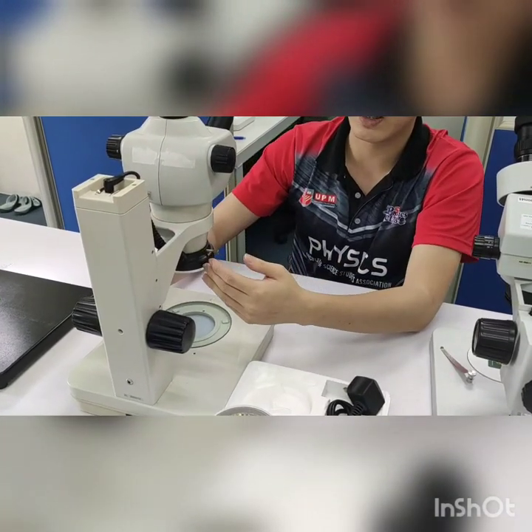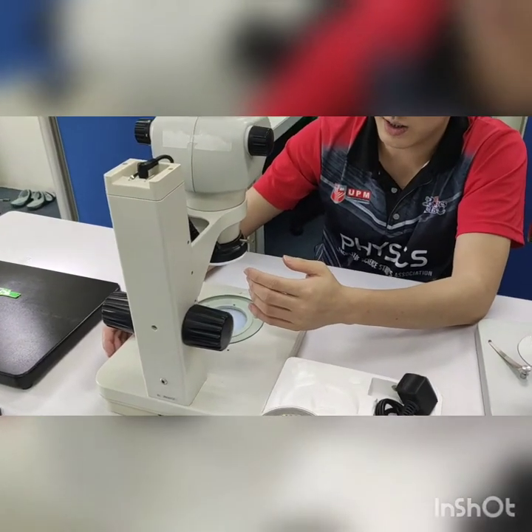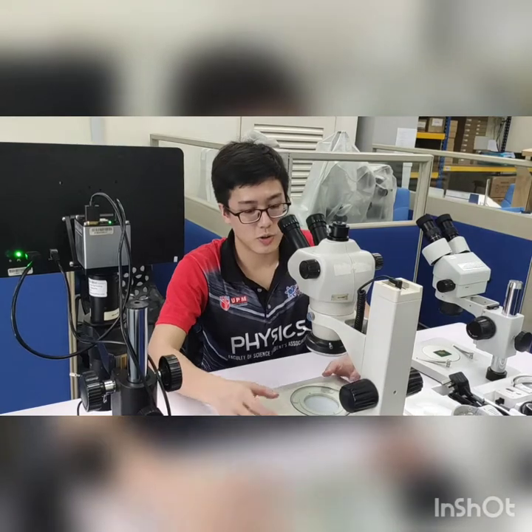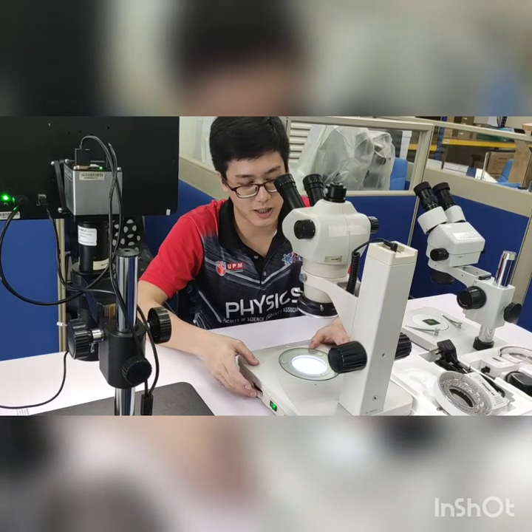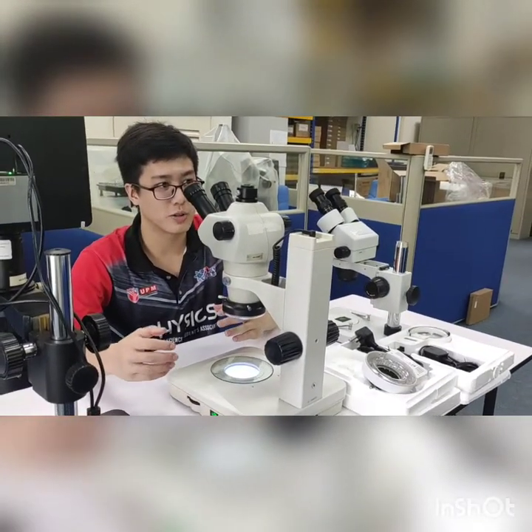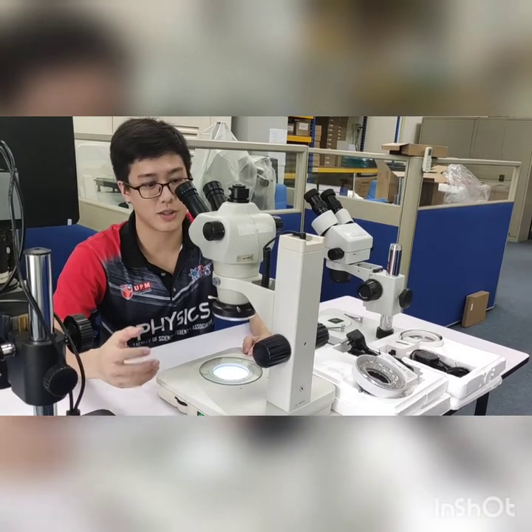Let's look at the lighting, which is also a little bit different. This is the LED lighting. We can adjust the intensity of the LED lighting at the side here. Other than this top light, we have this bottom light, which is the LED transmitted light, and here we can also change the intensity. The advantage of a transmitted light is that it is good for observing transparent and semi-transparent specimens, such as biological material like cells and tissue.